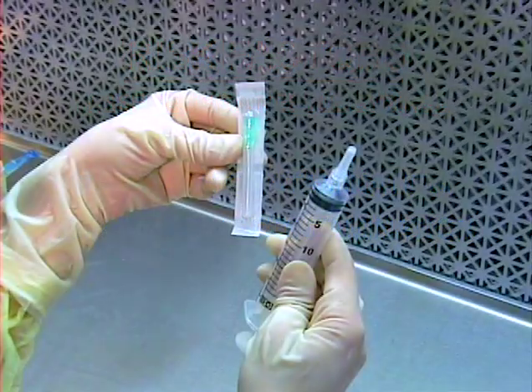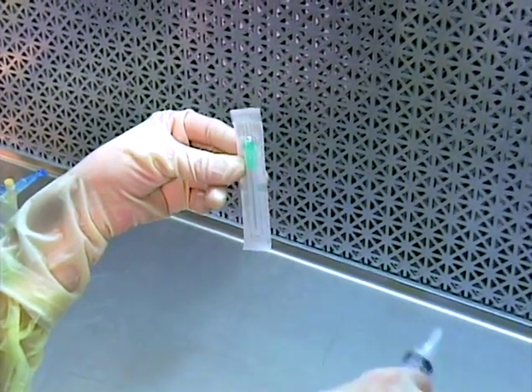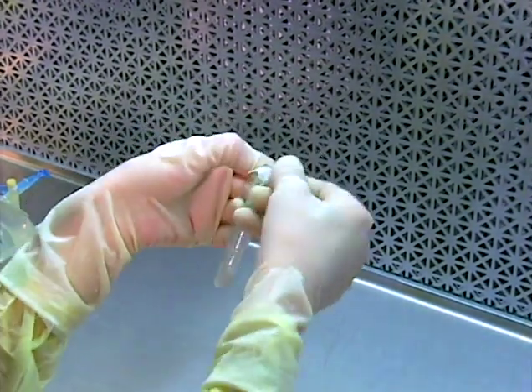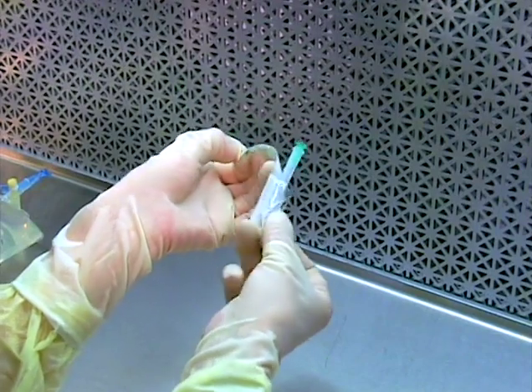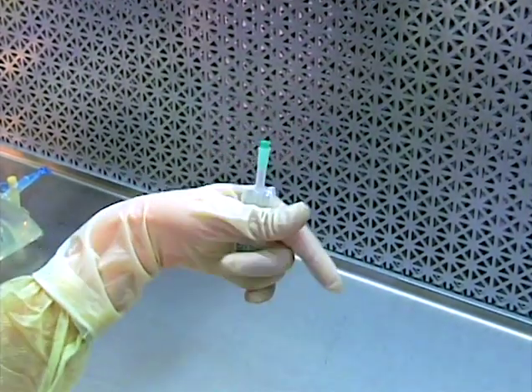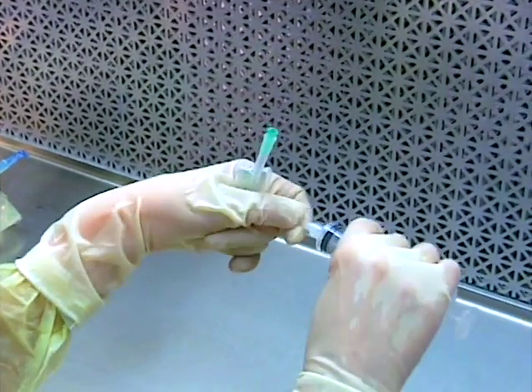For paper-wrapped needles and syringes with hub covers, aseptically grasp the flaps of the cover and peel them back, folding them down along the sides of the needle with the open needle hub pointed into first air, keeping fingers well away from the exposed hub. Lodge the needle tip securely between the palm and the last 3 fingers.